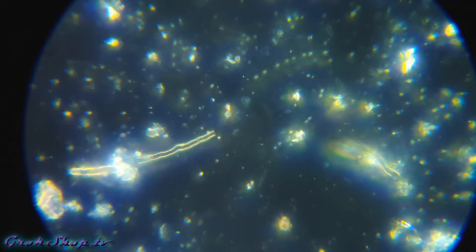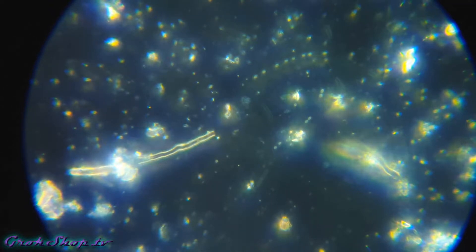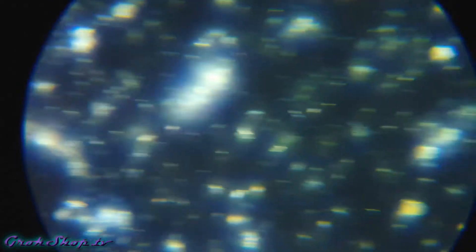Switching over to the dark field view now. You can see a little fungal hyphae here off to the left, and a tiny bit off to the right - looks like it's attached to some organic material.